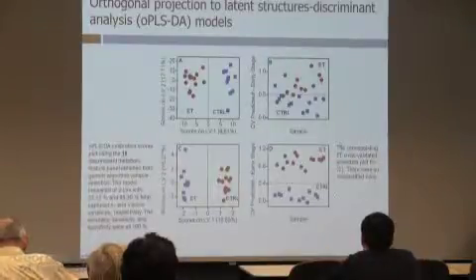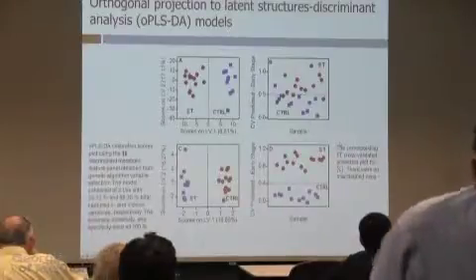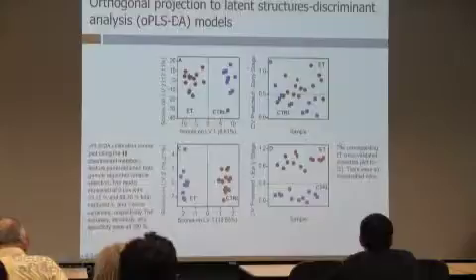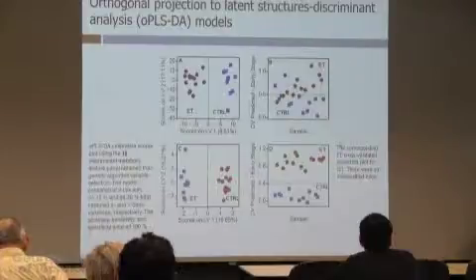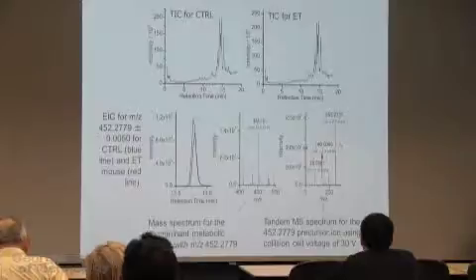And this is all nice and great, but now we need to know what those 18 are because nobody wants to predict on peaks. People want to know what are these molecules and do they make sense? Because if they don't make sense, then we need to start over again. Make sense means they do map into biological pathways that are known to be altered in cancer, and particularly maybe in ovarian cancer. Okay, so how do I identify these?